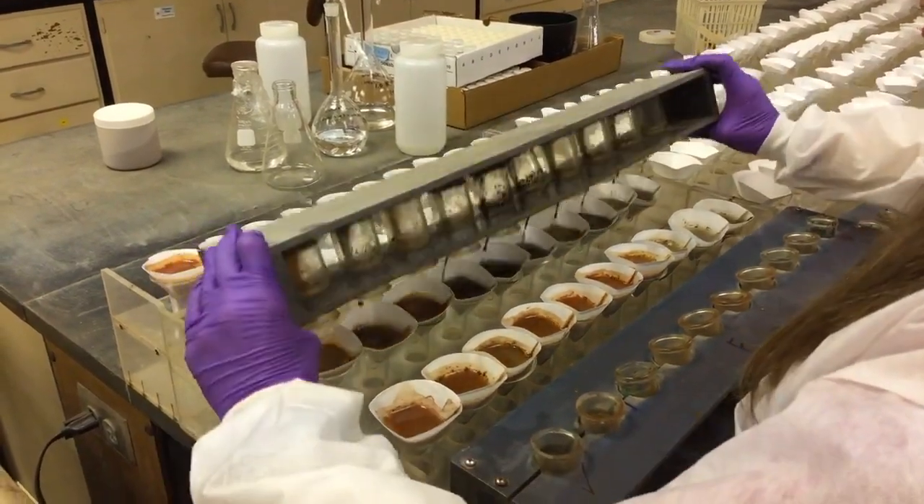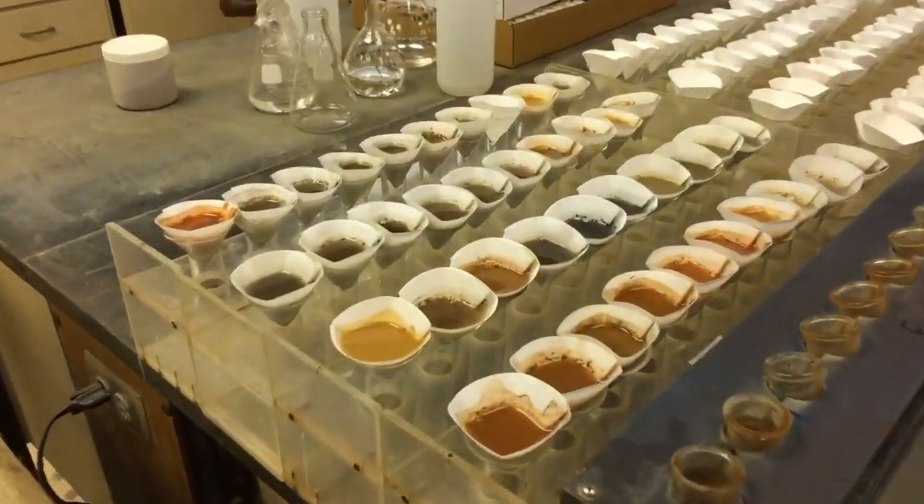After the samples have been mixed, they're poured into filter cones to produce a clear liquid test sample.